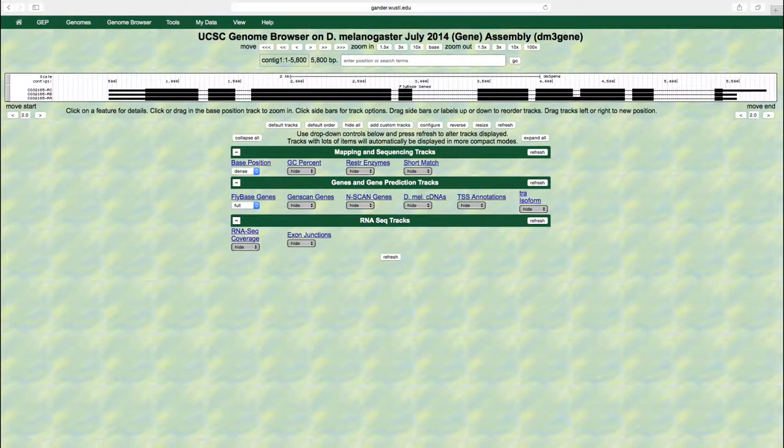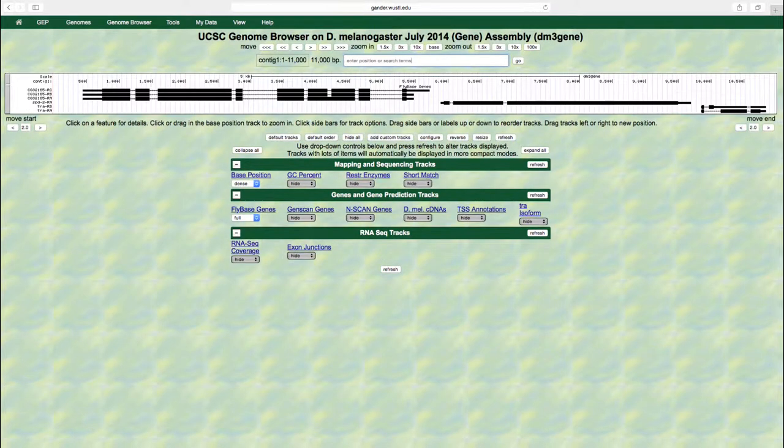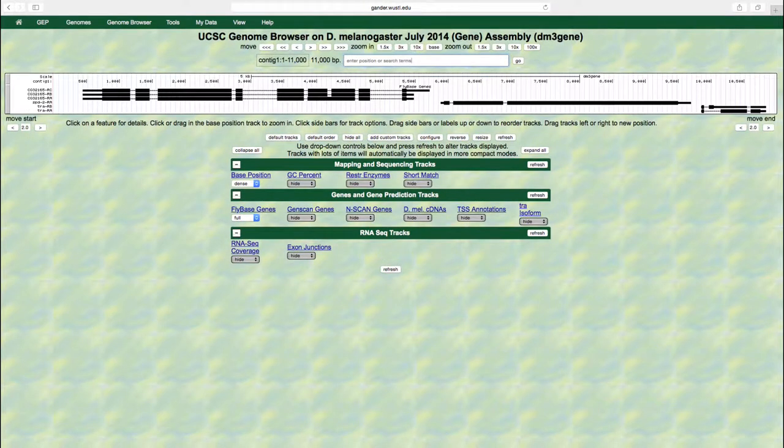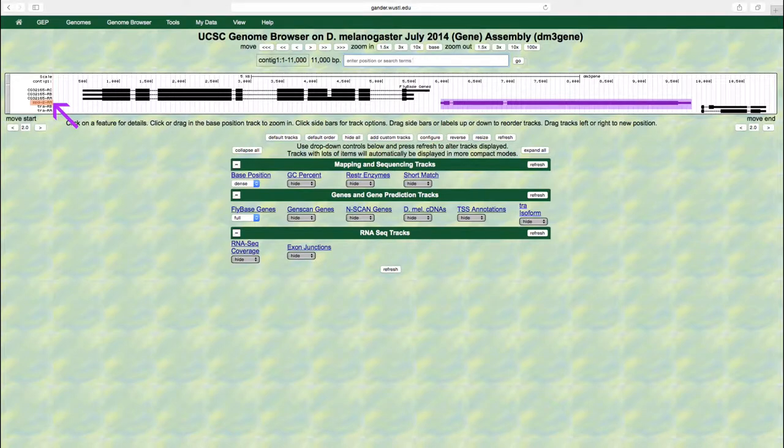Let's zoom out to the entire contig1 and look at the Spd2 gene. Enter contig1 into the enter position or search term text box and then press enter. We can see that there is only one isoform of this gene, isoform A. Therefore, only one kind of mRNA is transcribed.